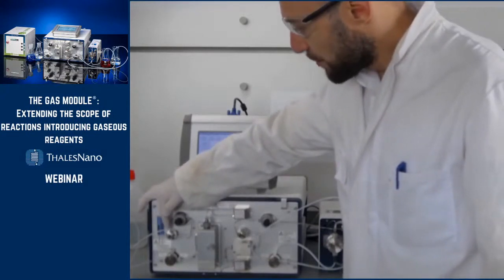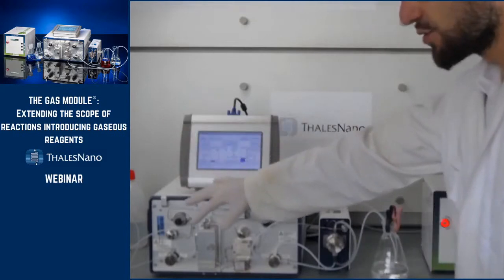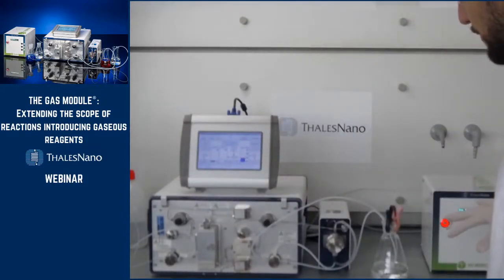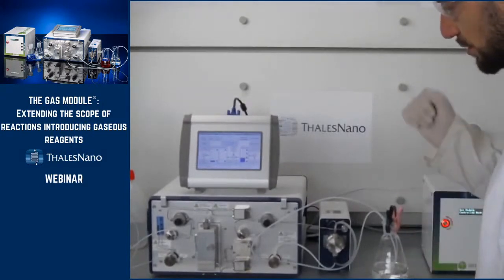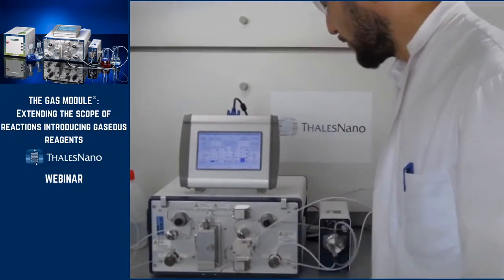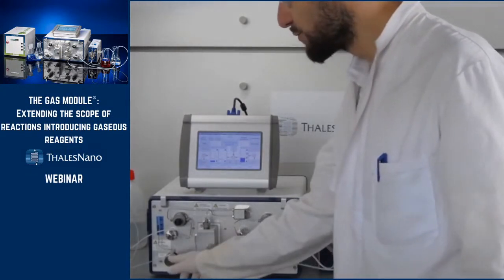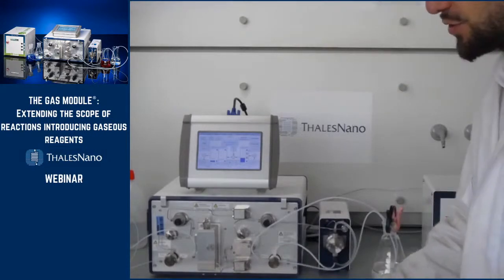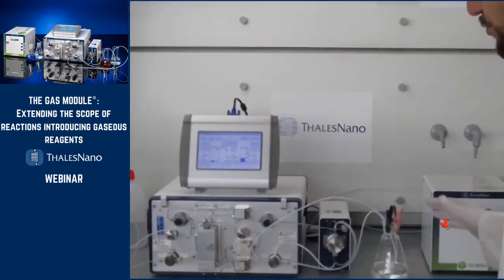Then it goes to a back pressure regulator, which creates the pressure through all the system, from the pump to this back pressure regulator. Then it goes to another two-way valve, in the same way as the first one, to either collect your product or send the solution to waste.